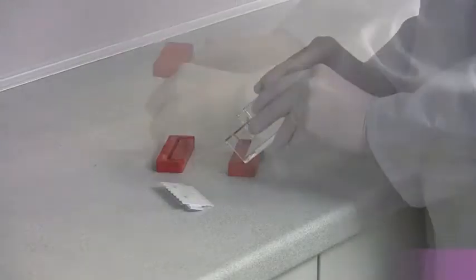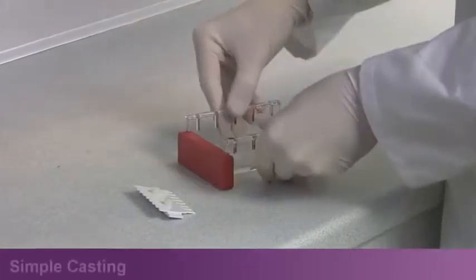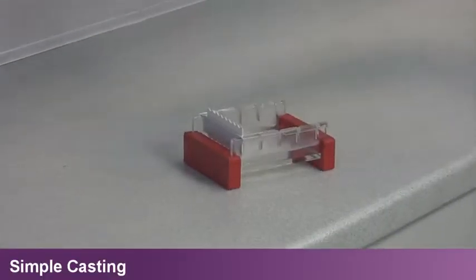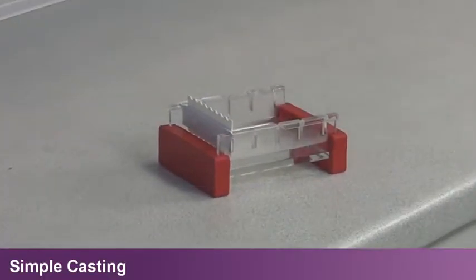Plug and go casting dams fit conveniently on the ends of each gel tray. This enables gels to be cast externally, allowing the tank to remain permanently in use if required.